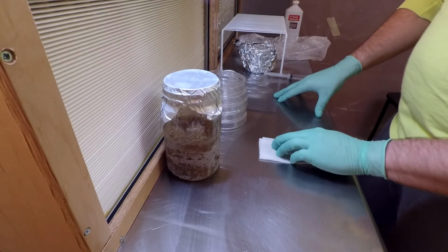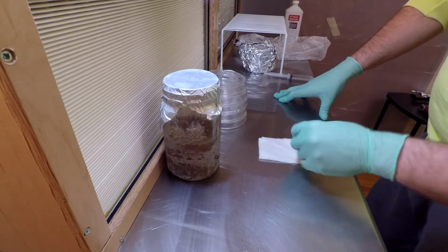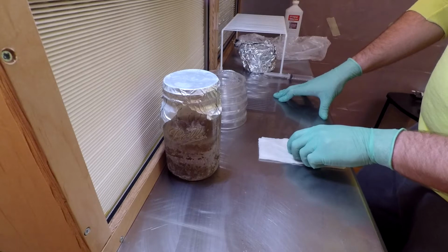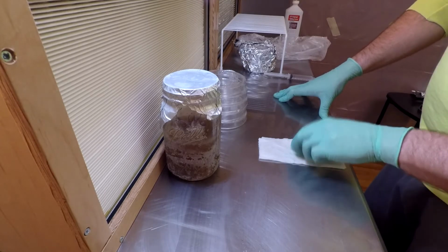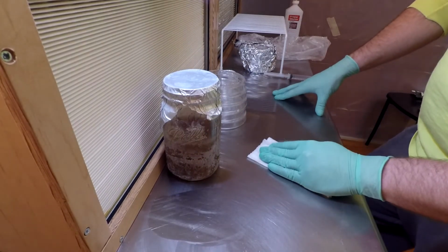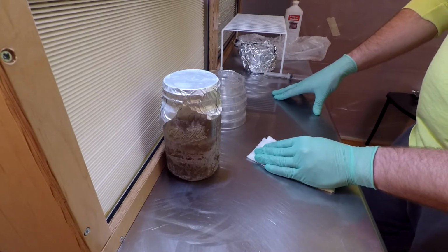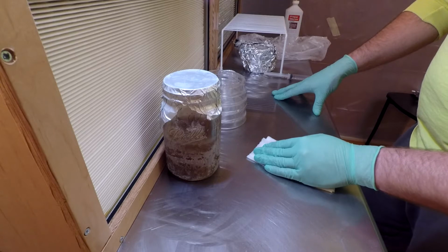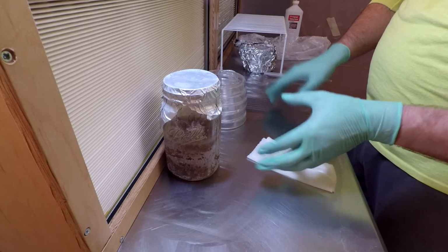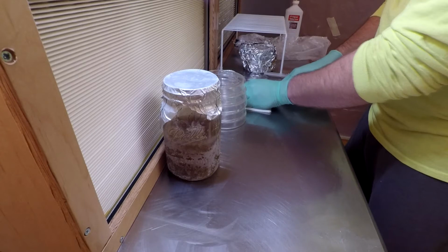Now perhaps it was because I did this all in my basement where I grow these that I got a higher amount of bacterial count in with the spores. I wouldn't think that would be any worse than upstairs since I have carpet and all that, you know, a regular house environment. So most likely it's just because of the high density of the spores. But if I had made the spore prints in this lab, you know, like one mushroom at a time, not enough spores to make a mess in here, I probably would have had better results.